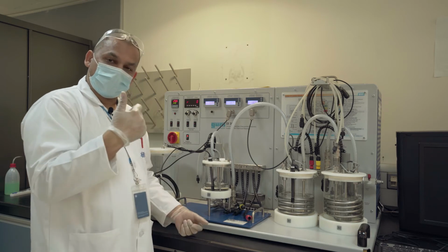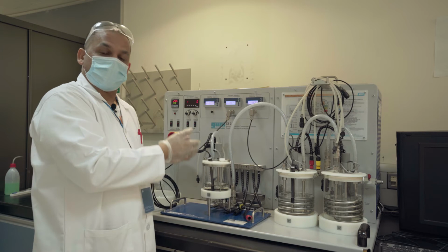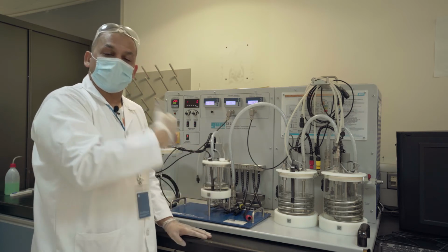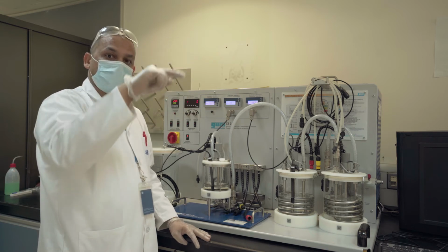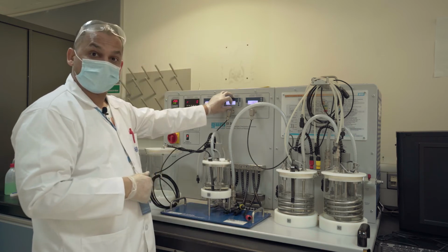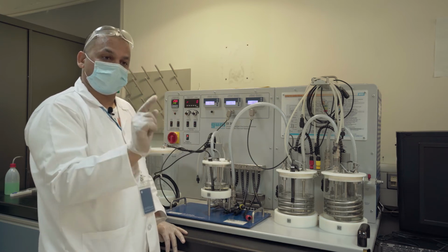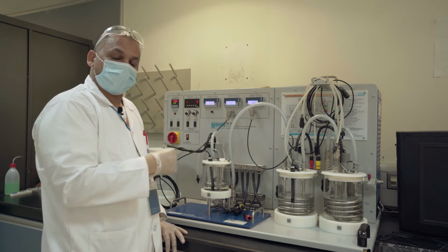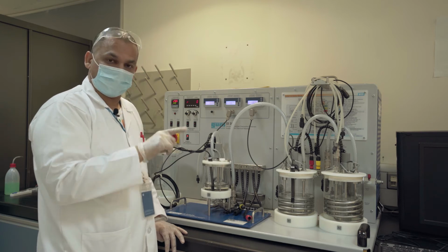Then what else is unknown is my A naught and EA. To do that, I do three different temperatures. I can do room temperature, then 30 degrees, 35, 40, 45, as many as possible, so that I can plot and find the final conductivity for each one of them once it's stabilized, and then get the intercept and the slope. The slope will give you basically the activation energy, and the intercept will give the A naught.